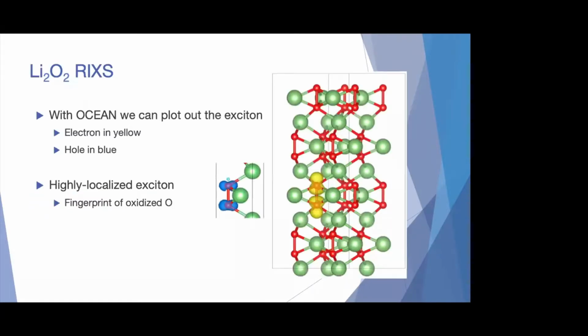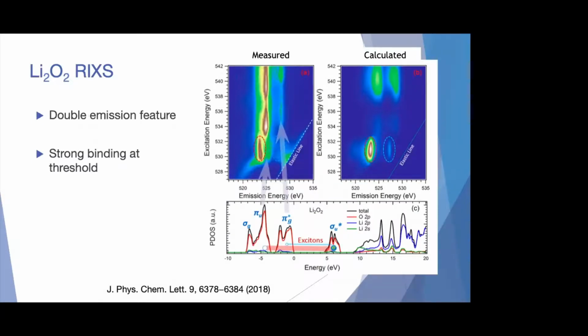Well, first, Karina, you have a question? Yes, hi, John. My question was about the RIXS picture that you showed. You have the issue of wanting to get some information on the binding, but also on the electronic structure. I was wondering if the effect of vibronic coupling could be used, assuming you have the experimental prerequisites and feasibility, because I see that in the elastic line you have this kind of feature that might be what we already talked about. Maybe with higher resolution you could get some more information out of that.